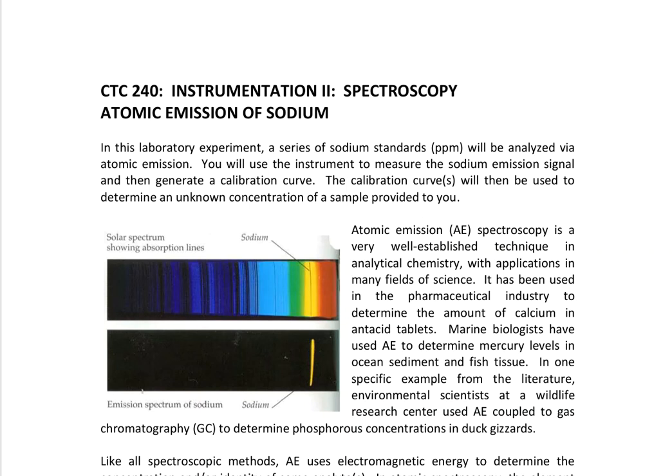All right, in this video, we're going to talk about atomic emission. So at this point in the course, you are probably watching these lecture videos on atomic absorption and atomic emission. And it seems like everything that we've done, even outside of this course, has been atomic absorption. Anytime we've gone over to this instrument, it's always been AA that has mainly been the focus.